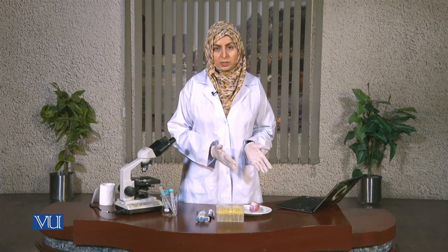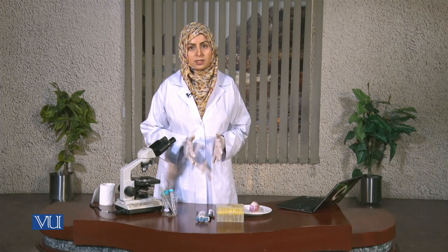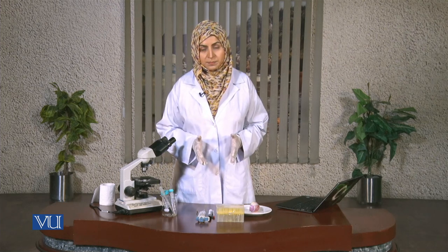Then we'll talk about the procedure — how the experiment works — and after that we'll go through the observations to identify our specimen. In the end we'll consider the mistakes or the errors that the students can make when they are making the experiment for the very first time.